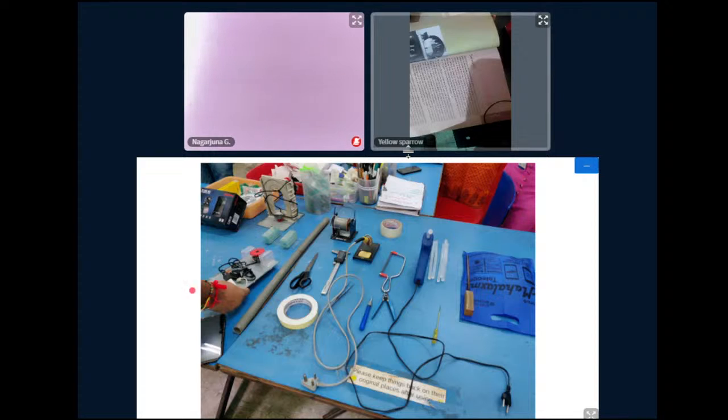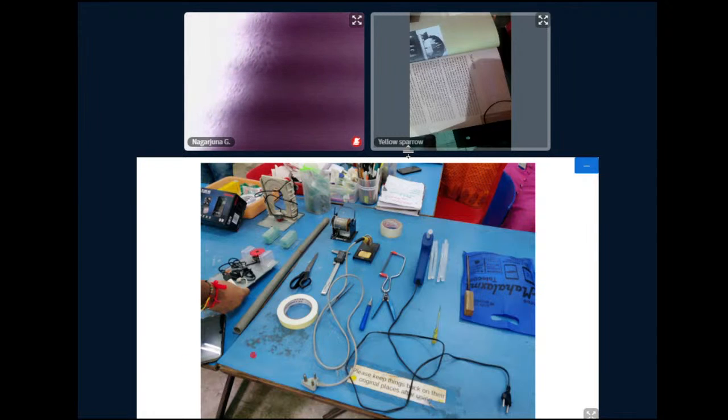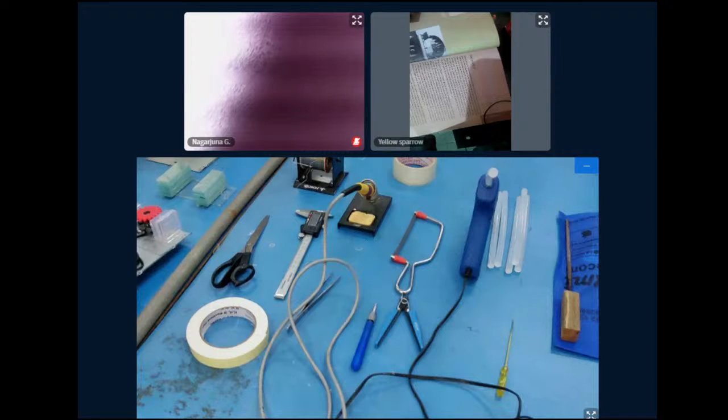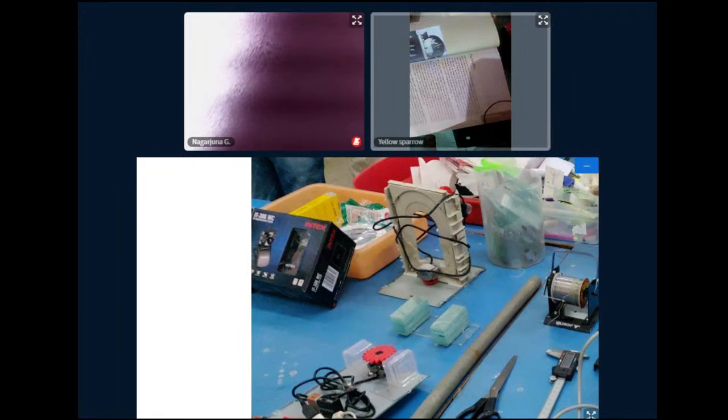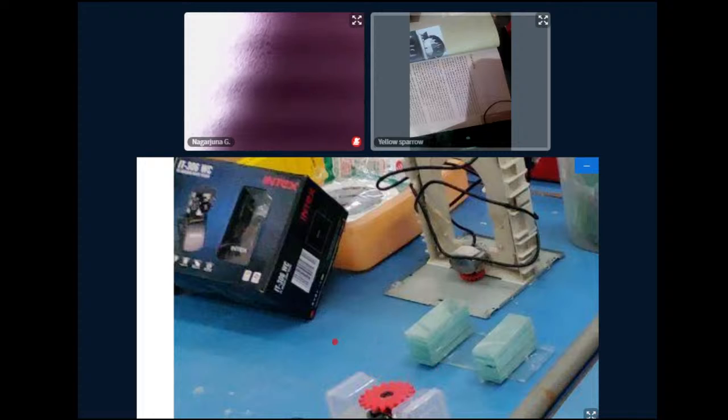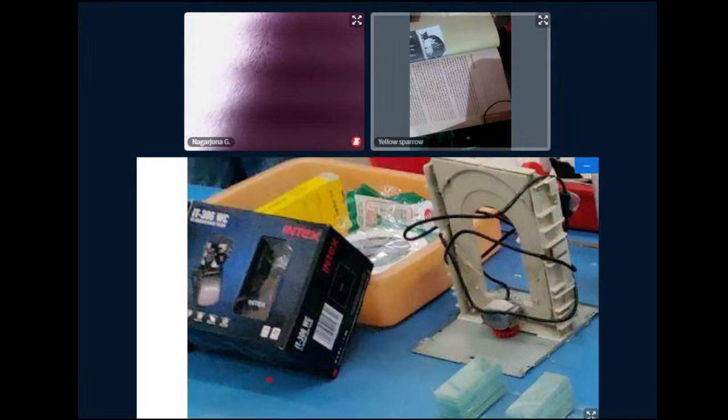Yeah. So when we are trying to make this microscope, as you can see in the image on the left-hand side, in the middle there is a webcam. DB, can you zoom in? Can you scroll it to the right? Yeah. So this was the microscope, and we used this Intex webcam at that time. There are two versions of the webcam you can find over here.